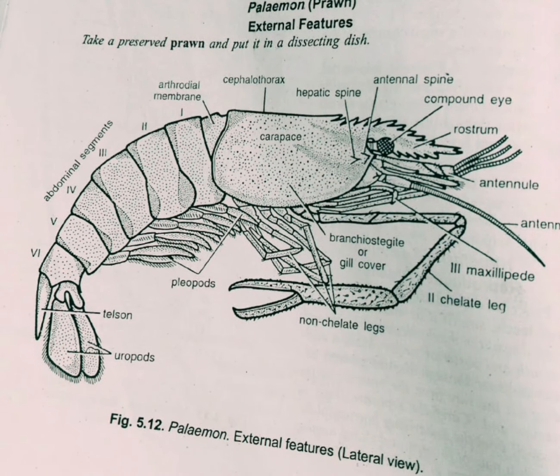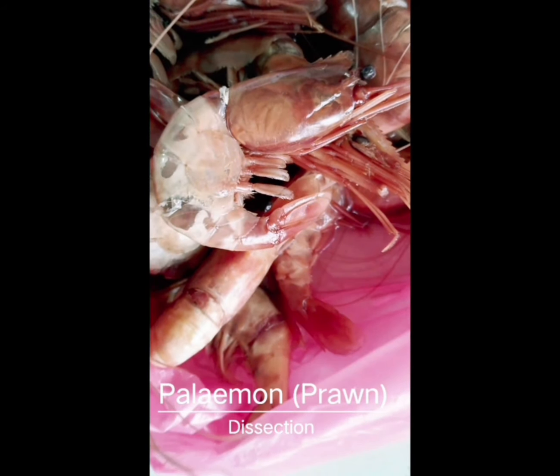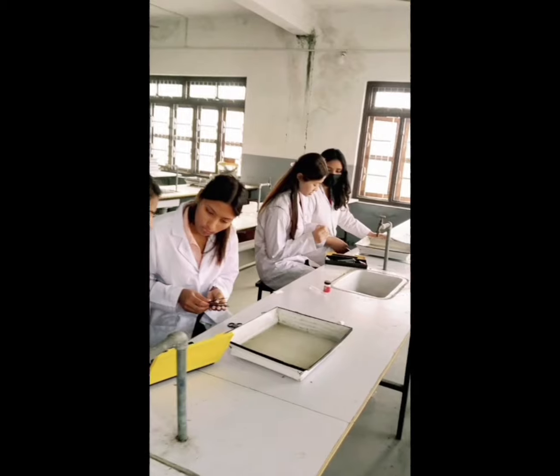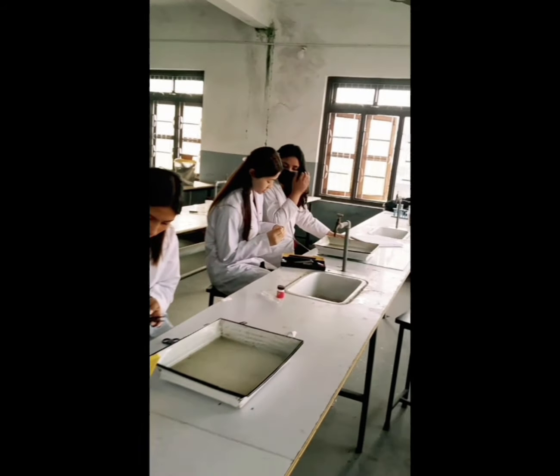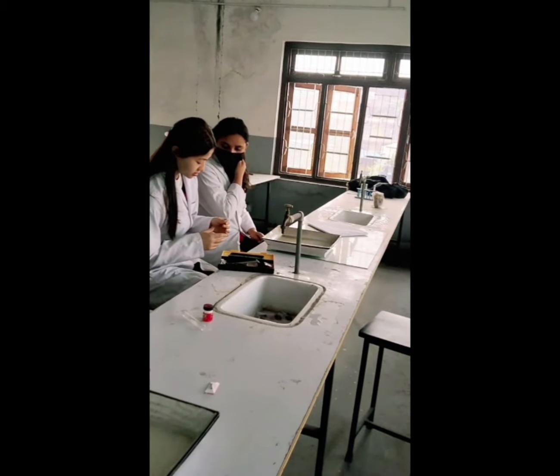Today we are going to learn the procedure of dissection. We have to take a preserved prawn and lay it down in a dissecting dish with the dorsal surface facing upwards. Our students are getting ready for their dissection with the dissecting tray in front of them.